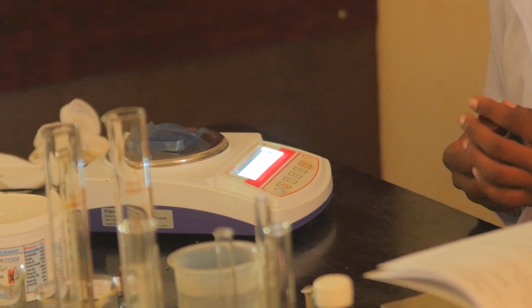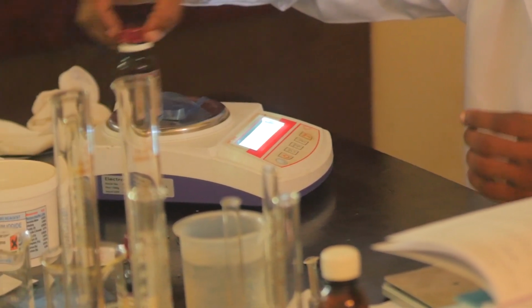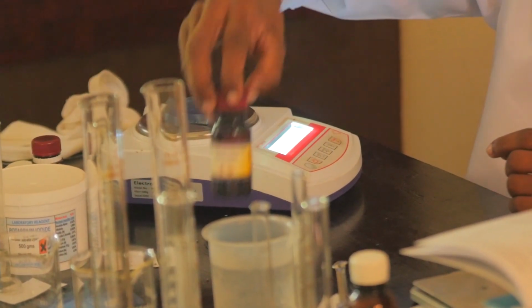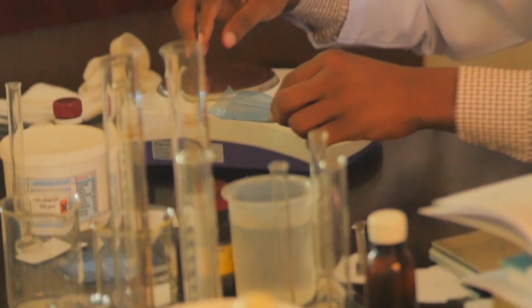Yeah, that's 0.5 gram of iodine crystals. So these are my iodine crystals. I have another tin with me here, iodine crystals. Then you remove the top.